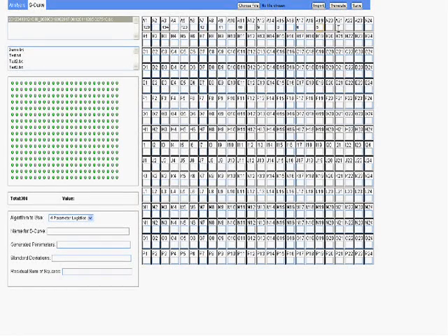And this will just take a moment, and if you have a lot of control wells here, it could take some time, and so we've had it so you can save them over here and reuse them later, so it doesn't take you as much time to test data after data.